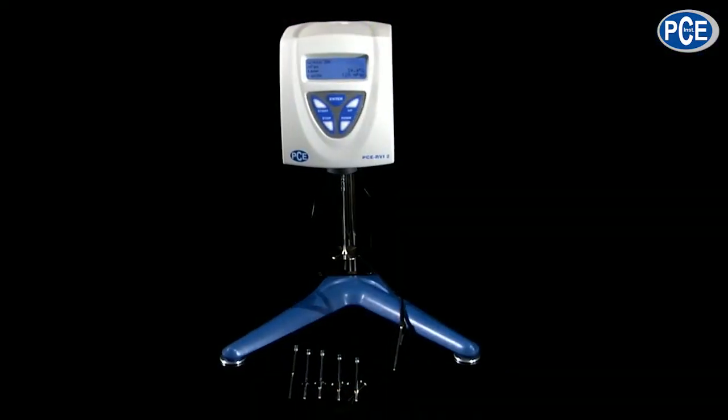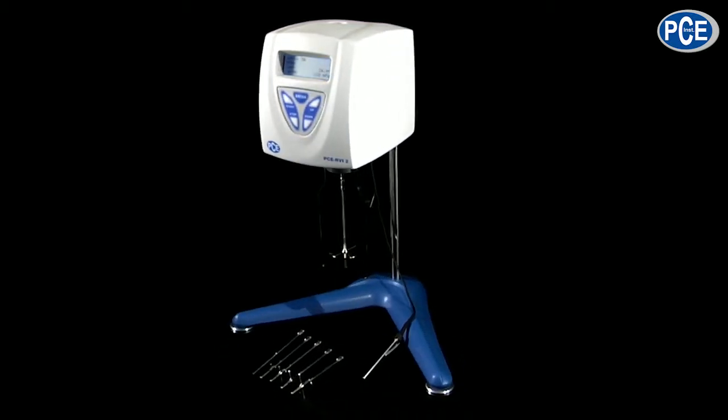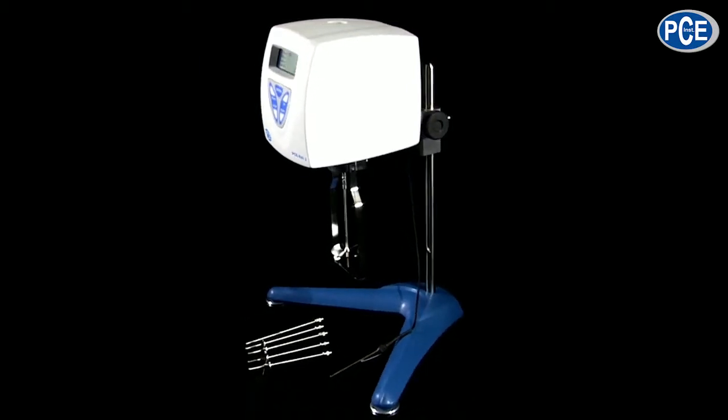How hard it is decelerated, up to 1% accuracy. There are different types, either from 3 to 2 million millipascal seconds, or from 20 to 13 million millipascal seconds.